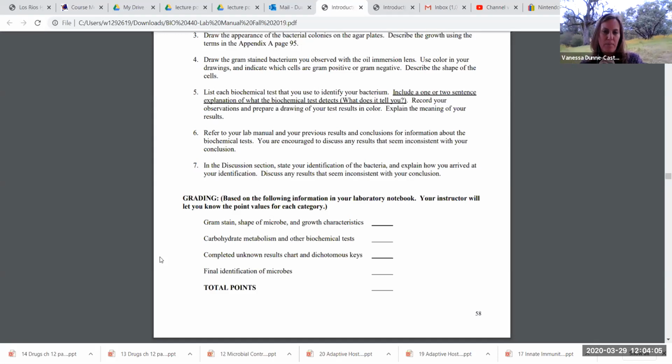So hopefully you see where I'm going with that. So just work through your key, describing the process of deductive reasoning, and then interpreting the results with characteristics of your organism. And all that should take less than a page. Some of you guys are going to get that done really, really quickly, and some will take that full page to write it out.